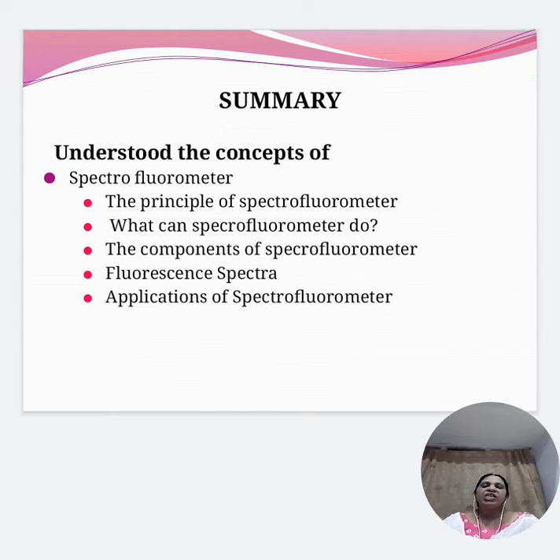resulting in fluorescent emission. The emitted radiation is analyzed by the analyzing monochromator, which permits only characteristic sample emission to reach the detector, which is nothing but the photomultiplier, blocking all undesirable spectral lines or spectral regions. When the fluorescent light falls on the detector, the registered photocurrent can be indicated on a microammeter, a recorder or an oscilloscope.